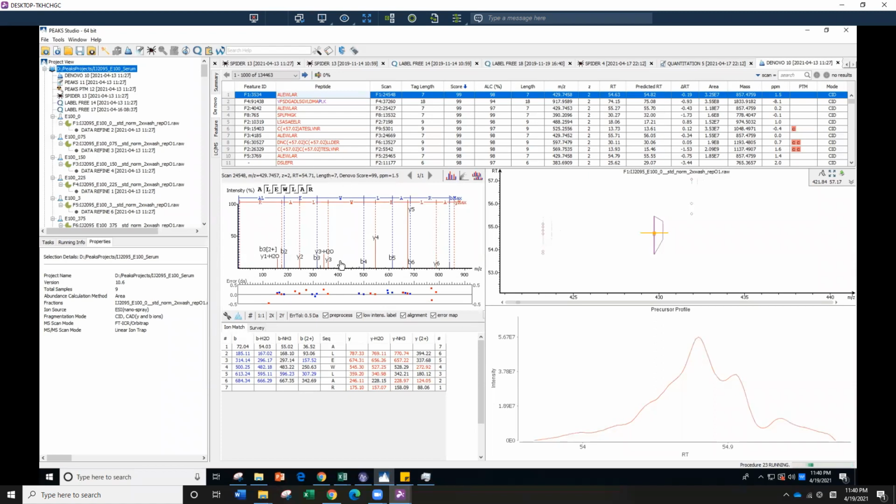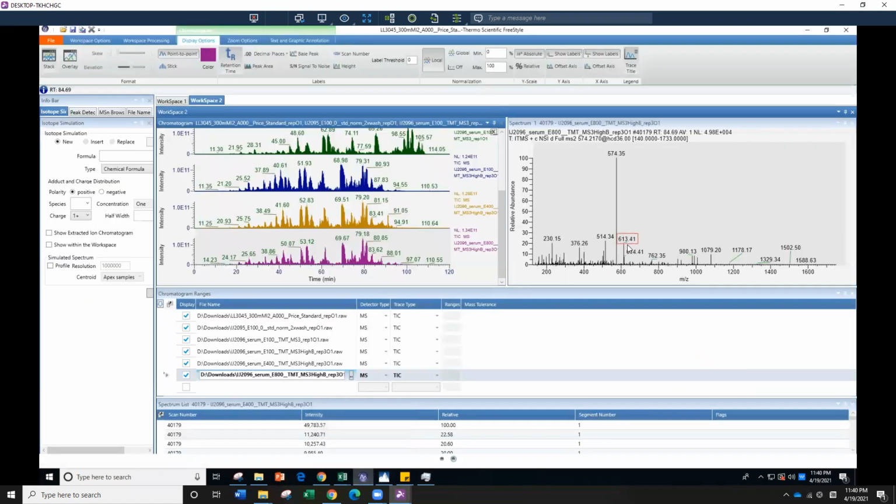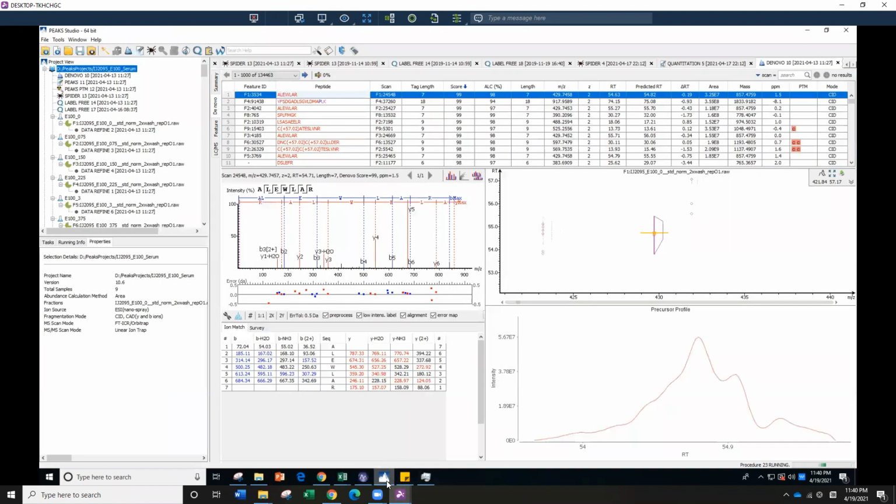So that's our MS2. So we have all these small pieces. Again, just to show you a better idea, this is an MS2 spectrum. After our MS1, we select one precursor and one mass and fragment it into all these fragments that we have from that precursor. Okay, so coming back, this is a more clear spectrum here.